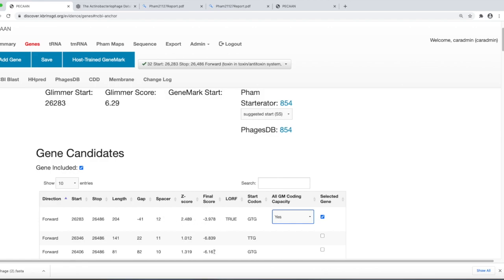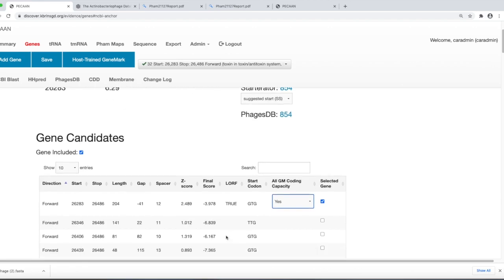It's the best one here as far as the choice goes. If we were to pick the 22 for the gap, that's not a plus or a minus. So this is a little bit of a minus because it's a big overlap. All the other ones are pluses. This is a big plus versus having no for the coding capacity. And so overall, looking at this sum, I would pick this one.